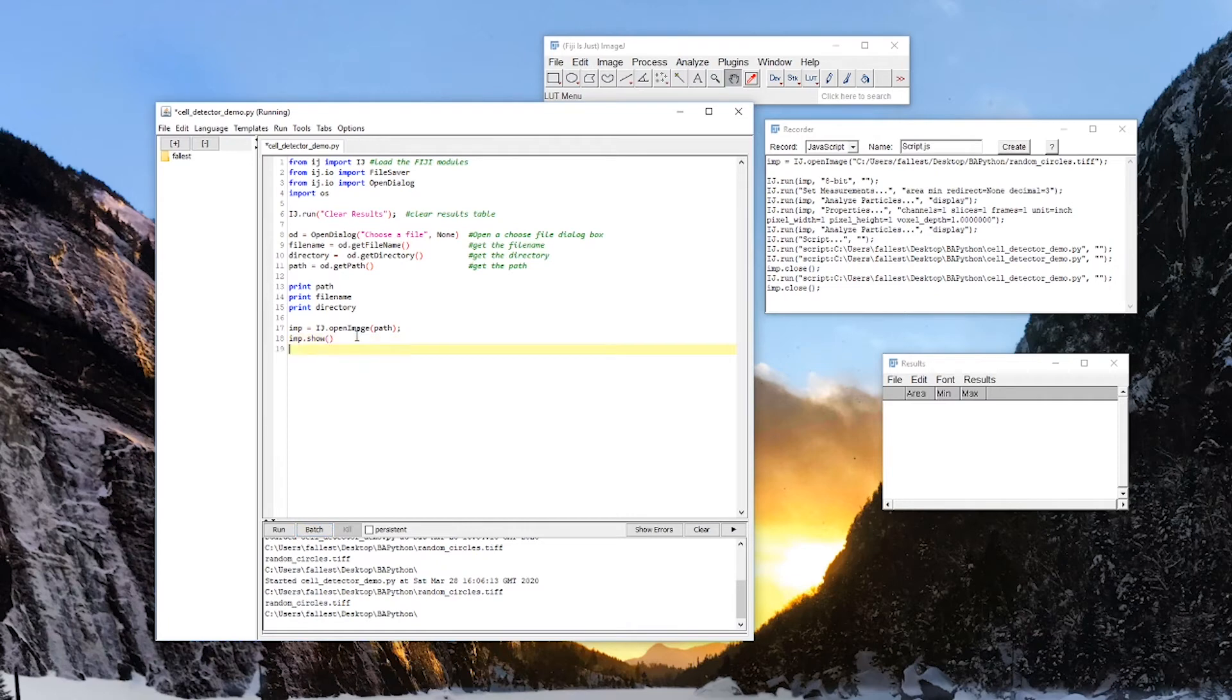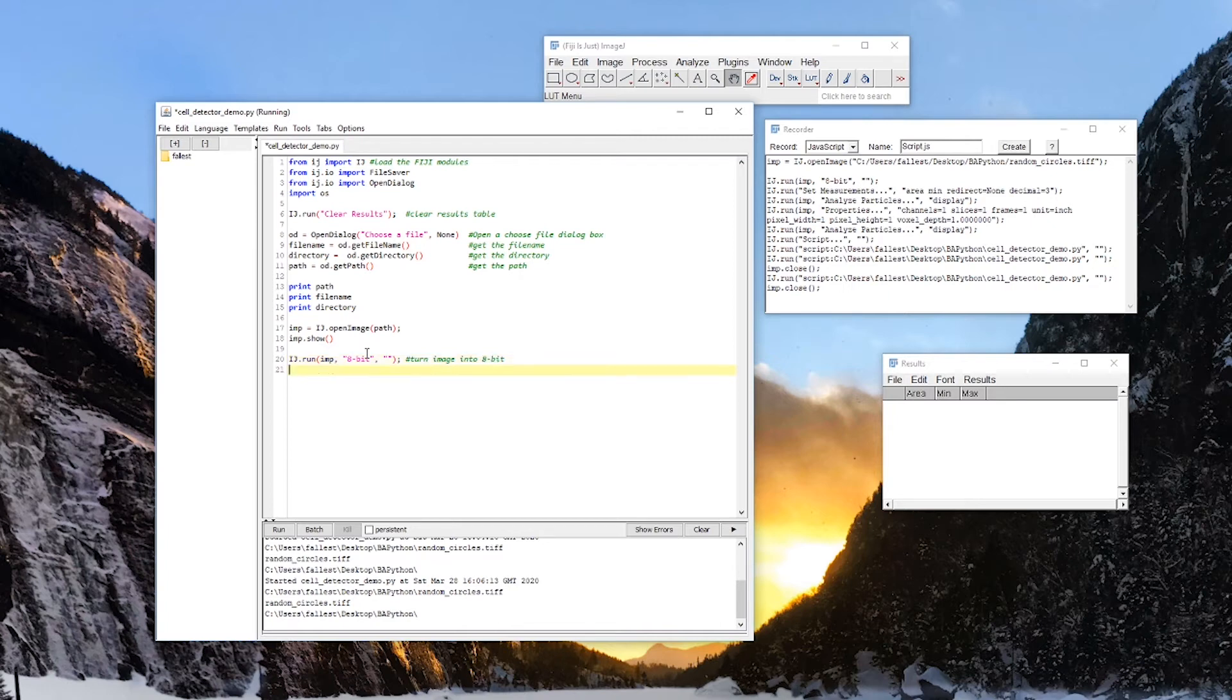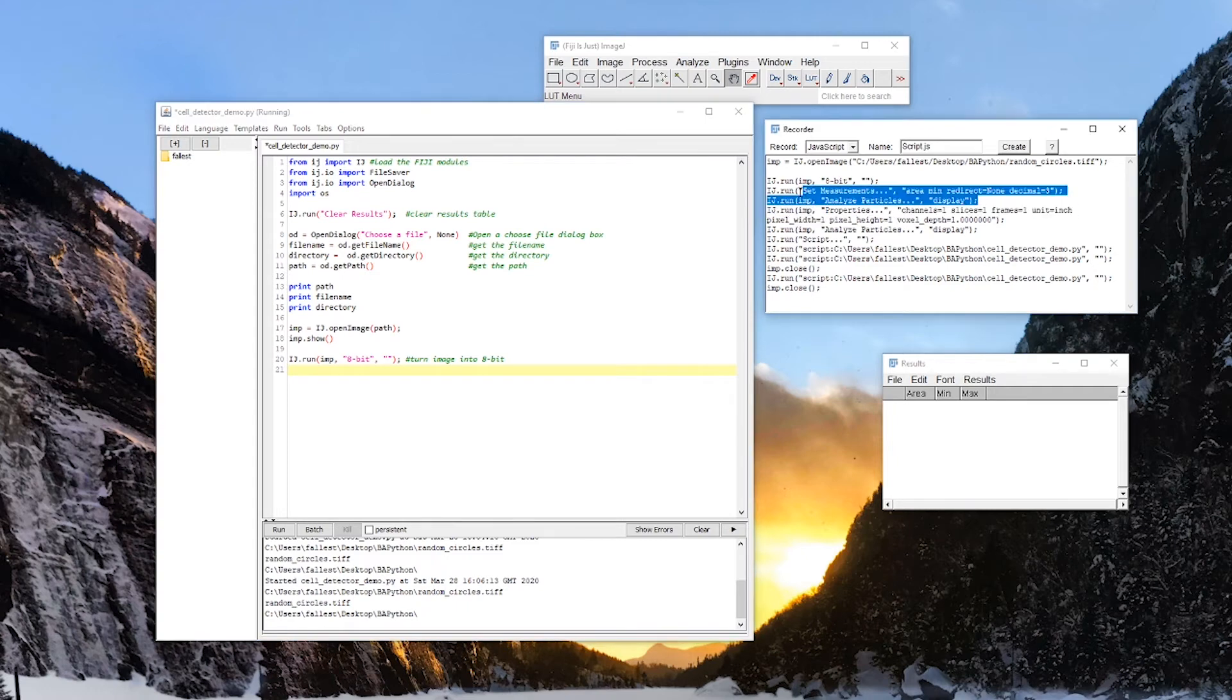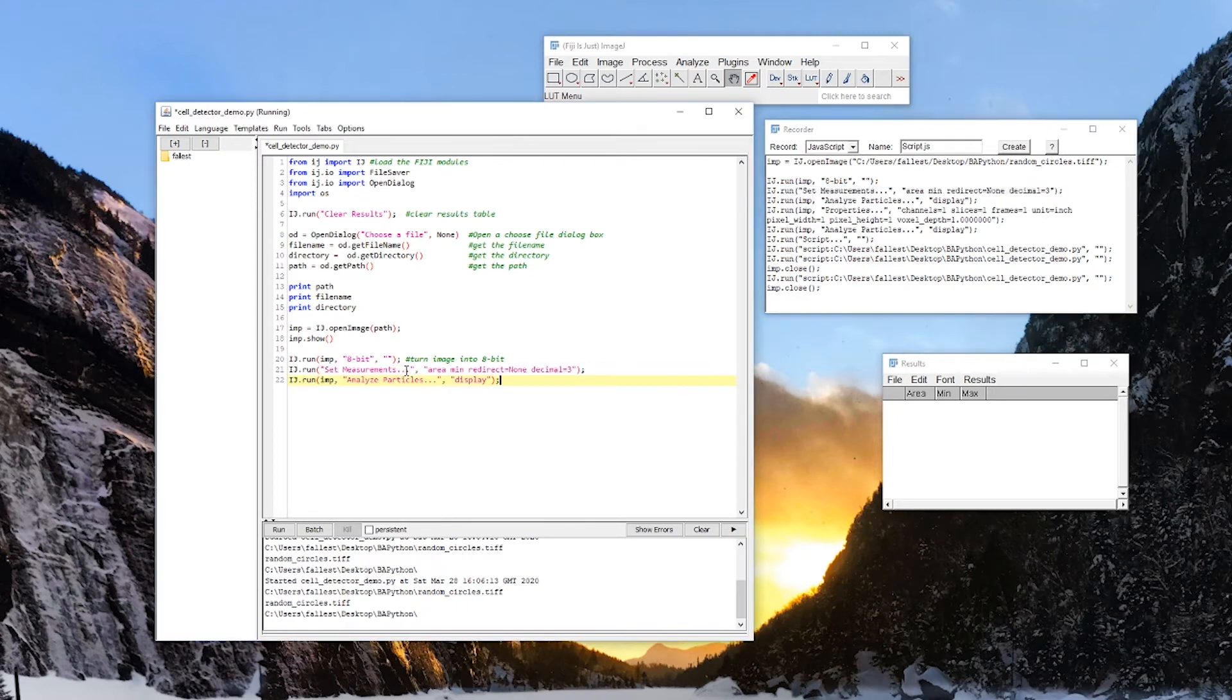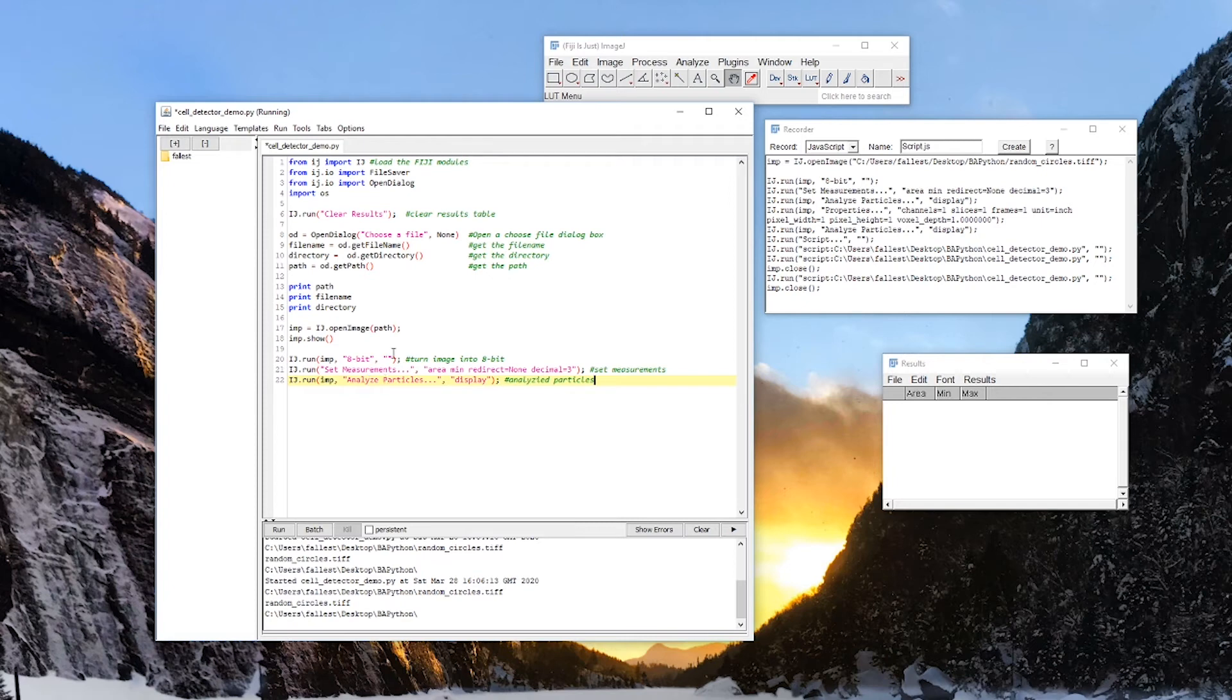So after imp.show, well, the next thing we did after we opened the image is we turned that imp into 8-bit. So I just plug that right in here. Turn image into 8-bit. And after that, we set our measurements, and we ran analyzed particles. Set measurements. Analyzed particles. And you'll notice that in this case, we have used the American spelling of analyze. That's actually really important. There's another analyzed particles function in Fiji, if you use the British spelling, that does something completely different. I don't know why.